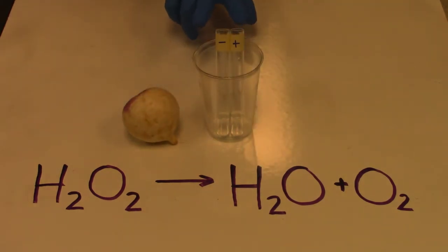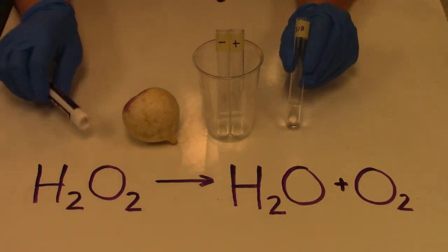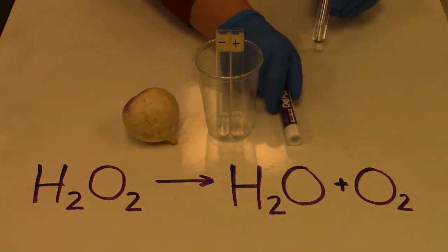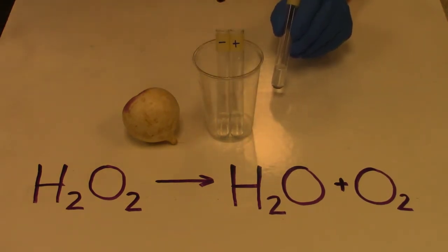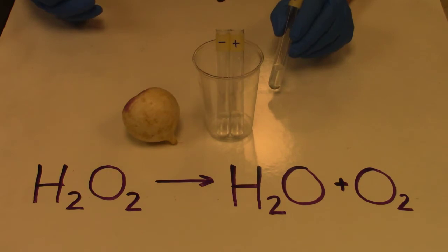Now, to each of these tubes, we'll be adding a few other substances. To each, we'll be adding substrate, indicator, and a buffer. The substrate is the hydrogen peroxide itself. It's what we expect to break down in the reaction. And because we really can't see water or oxygen, we also need to add an indicator. We're going to use guaiacol, because in the presence of oxygen, guaiacol likes to bind with oxygen, forming tetraguaiacol, which can be visually seen as a nice brown color. And the darker that brown color is, the more product we have.